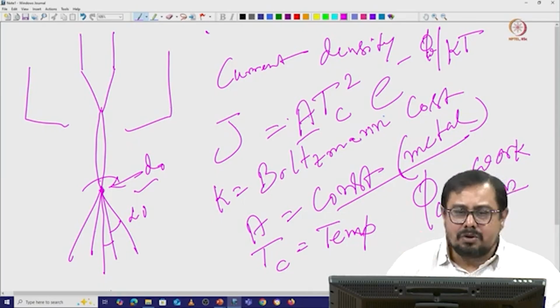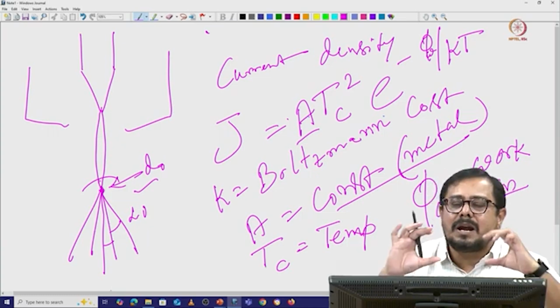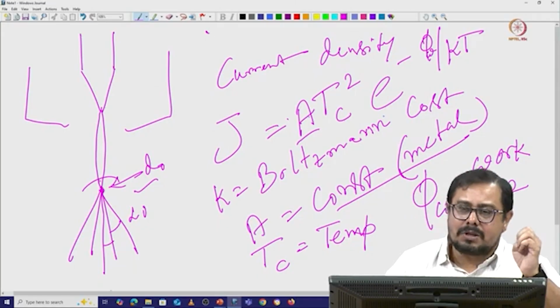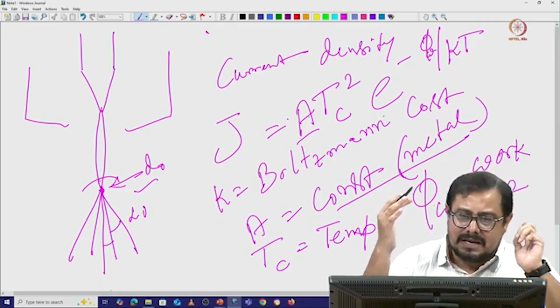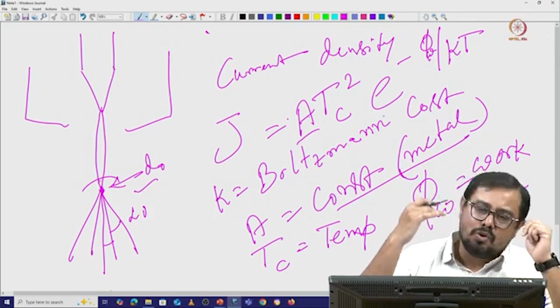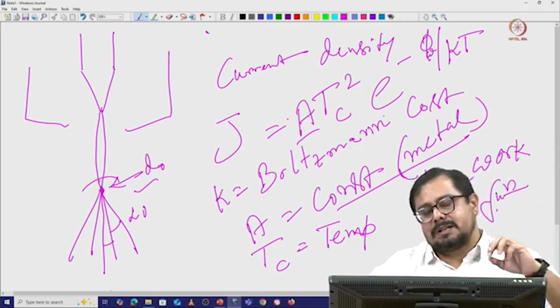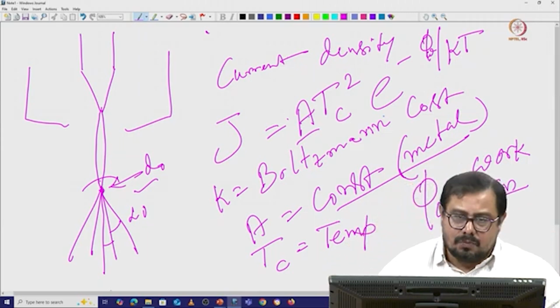One more thing I want to add: for the field emission gun, most of the time we are using two anodes, anode 1 and anode 2, which help pull out the electrons, and we are using a normal tungsten filament. We are giving the heat energy, but at the same time these two anodes help us, so we do not have to apply very strong heat energy to extract the electron, because there is a very strong electric field which helps us pull out the electron.